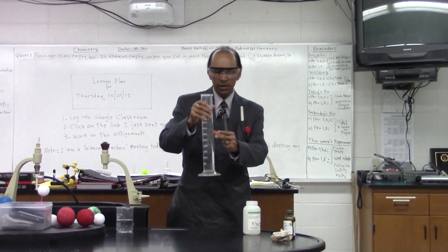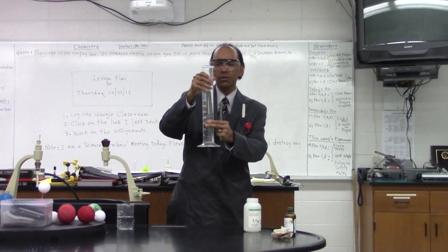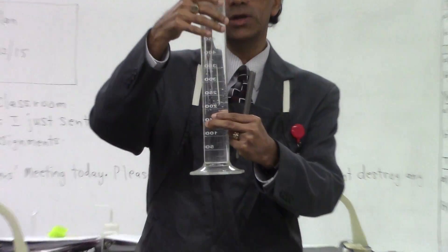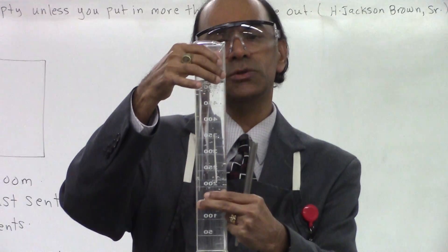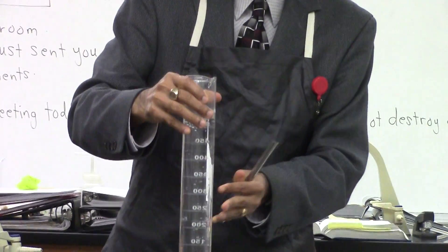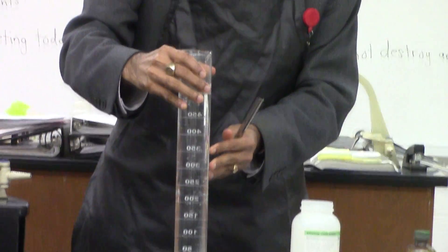I have in front of me here a tall graduated cylinder. It goes up to 500 milliliters. It has tap water inside of it.